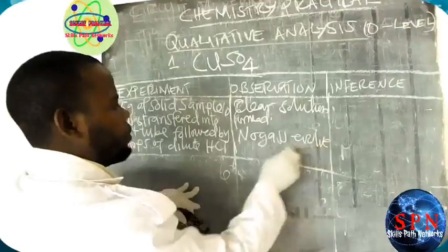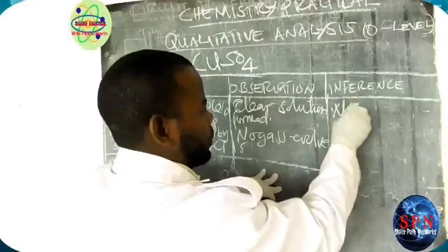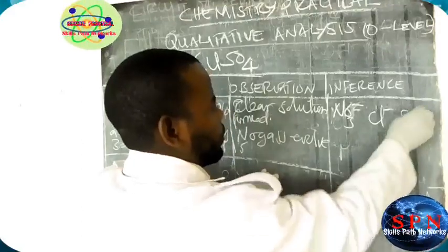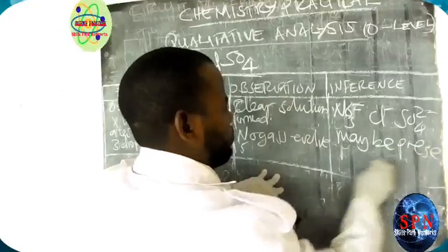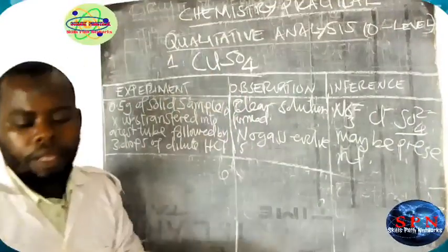It means nitrate, chloride, or sulphate may be present. It means the sulphate is there.